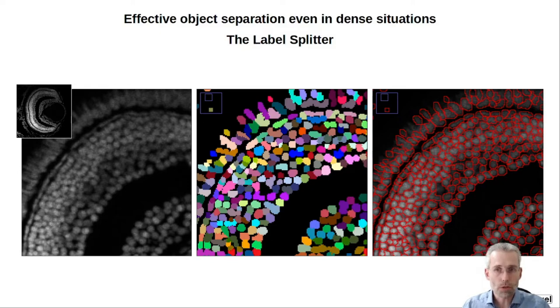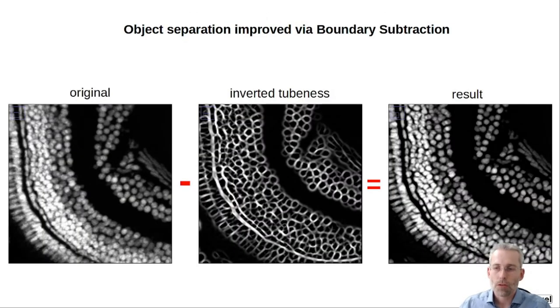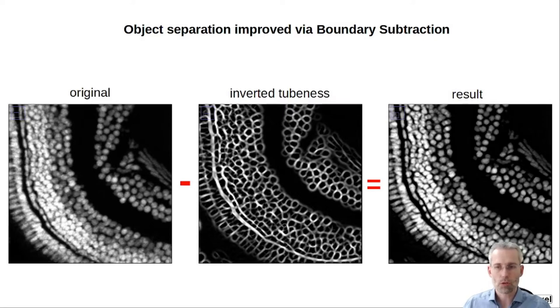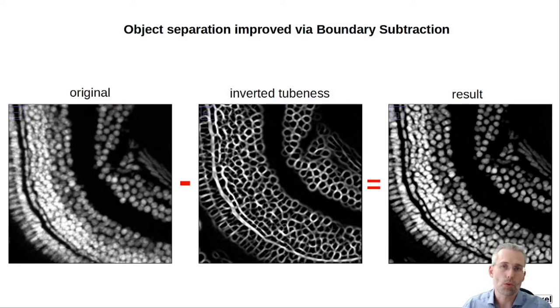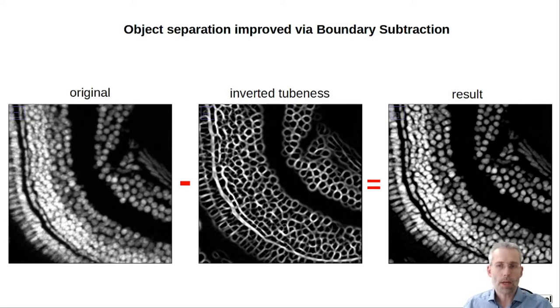So what is the difference to other tools? The separation works especially well because, dependent on the method, an inverted tubeness filter is used — a Hessian-based tubeness detection is run. These tubeness structures are then subtracted from the original image and, similar to an unsharp mask, this will actually carve out the objects more specifically, enabling better detection on the one hand, and better separation of those objects from each other on the other.